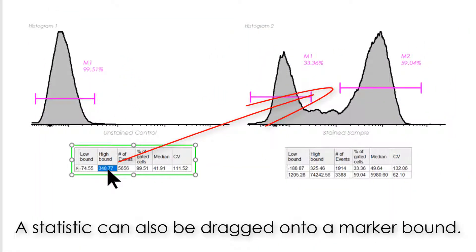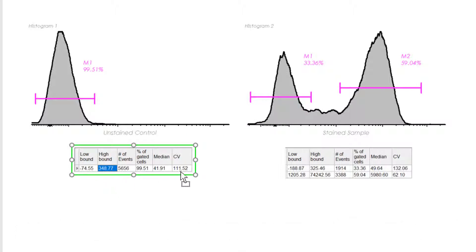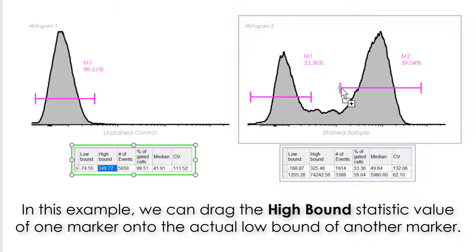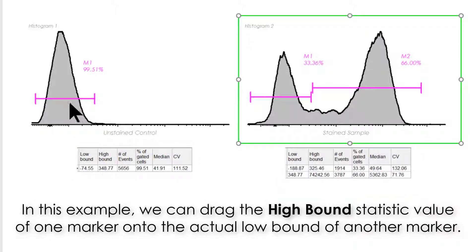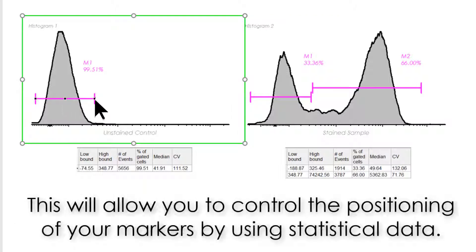A statistic can also be dragged onto a marker bound. In this example, we can drag the high bound statistic value of one marker onto the actual low bound of another marker. This will allow you to control the positioning of your markers by using statistical data.